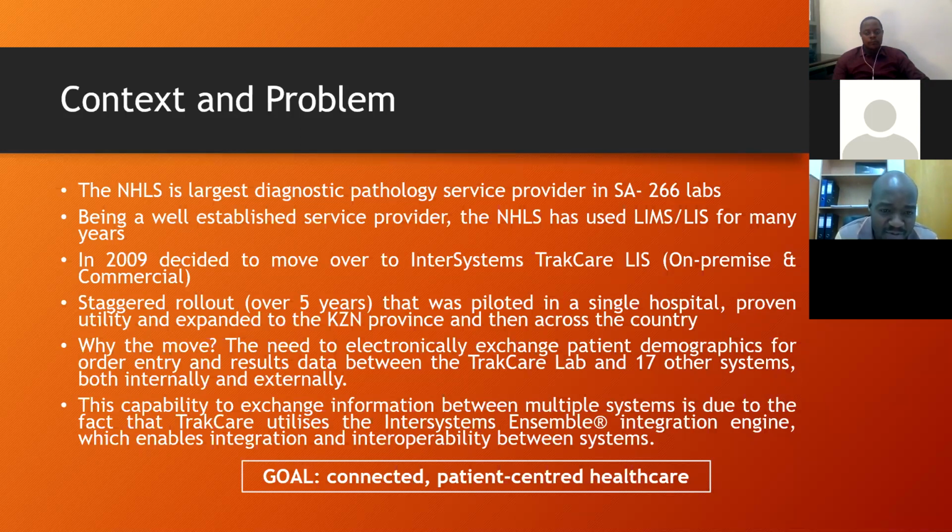The reason why we moved was that we wanted to enhance exchange of patient demographics and order entry, because some of the hospitals we already have in South Africa have a health information system. So we needed a centralized system that is interoperable with already existing legacy hospital information systems.